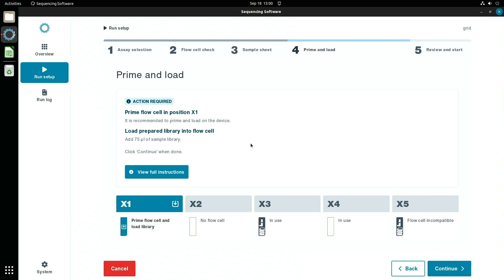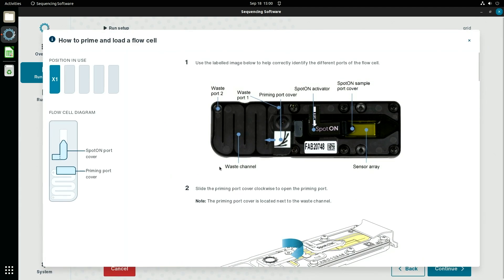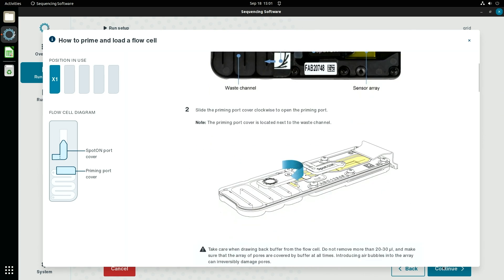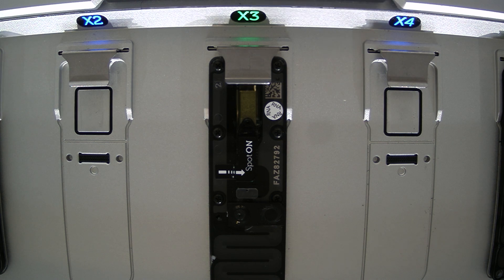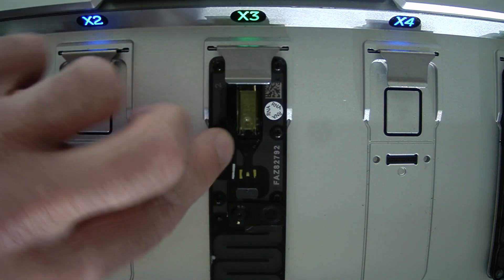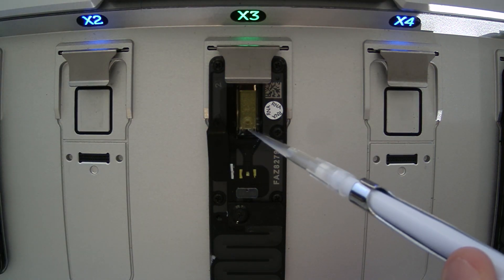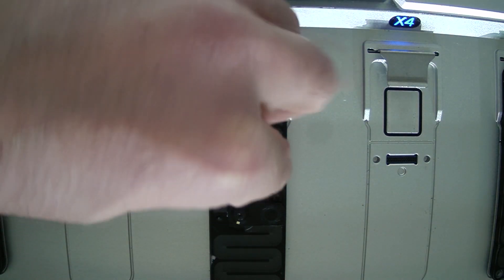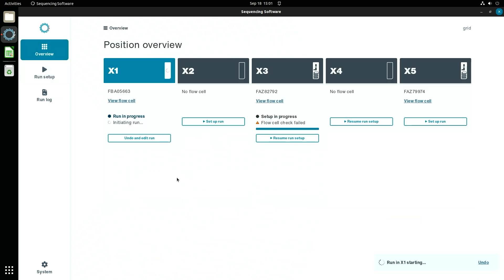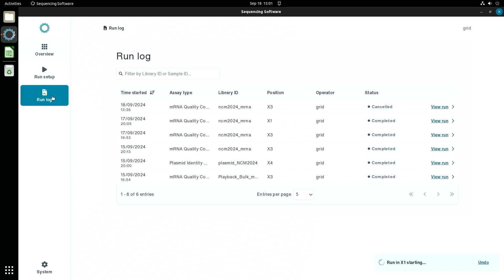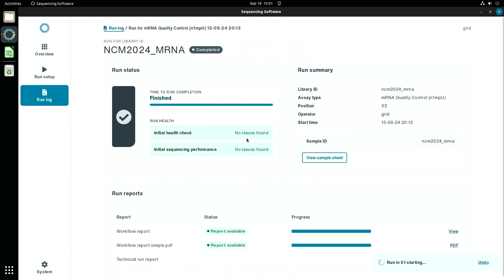Another feature of the QLine device is that it provides step-by-step instructions on how to load a flow cell on screen — useful for new users or if you need a reminder. Loading a flow cell is not a very involved process; it really only involves putting your sample into the port. Once that's done, we return to the Gridiron and begin the run. The sequencing run takes approximately two hours and will then produce your final reports listing the QC status of your sample. We can look at past runs performed on the device and see an example of one such report.